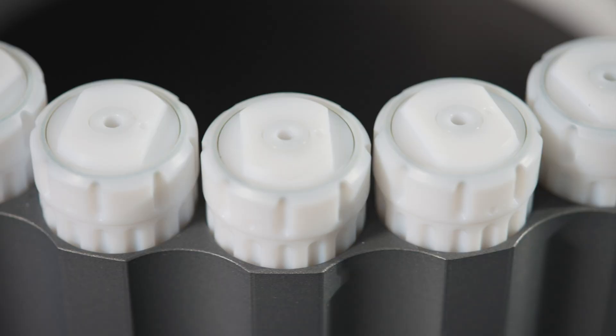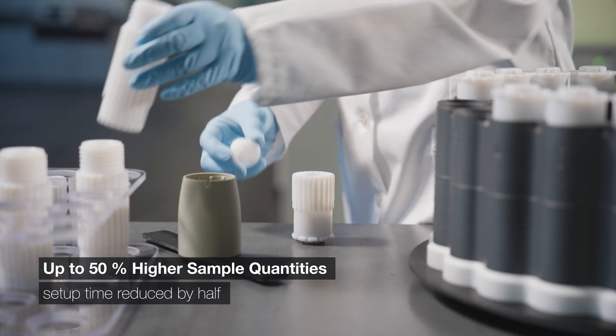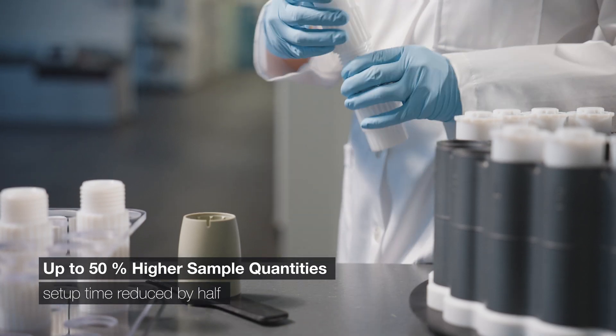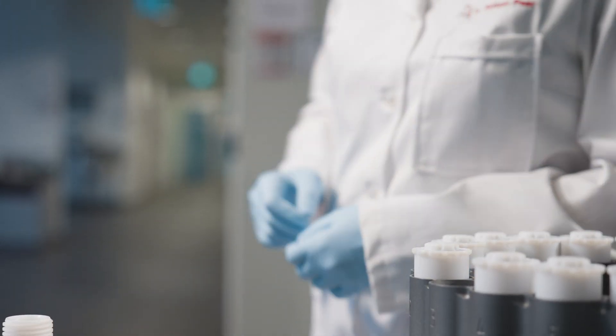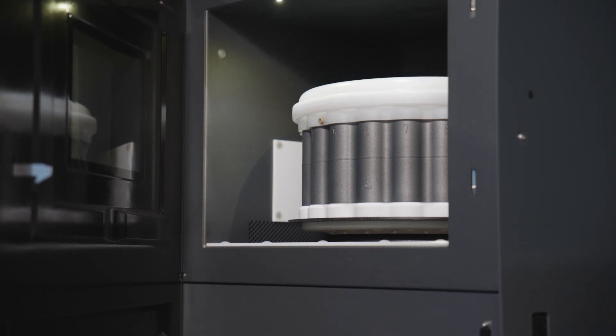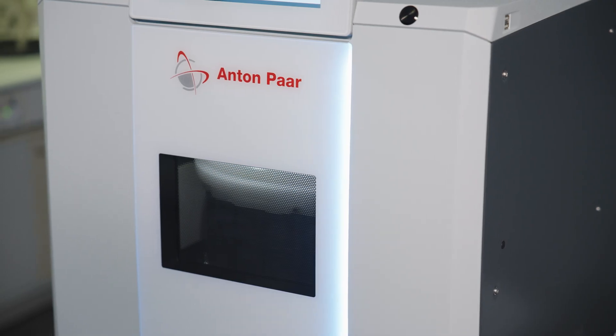The HVT vessels are ideal for acid digestion of routine samples. For demanding samples, the SVT vessel and the advanced SmartTemp 2.0 sensor offer unmatched performance. They handle up to 50% higher sample quantities, while setup time is reduced by half.